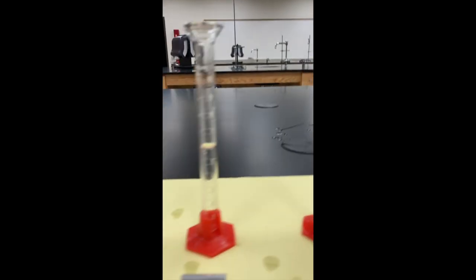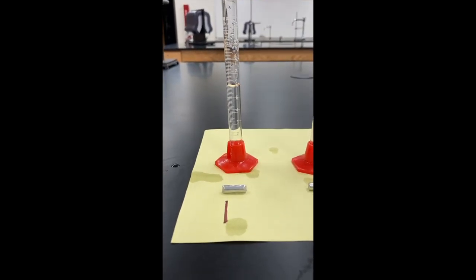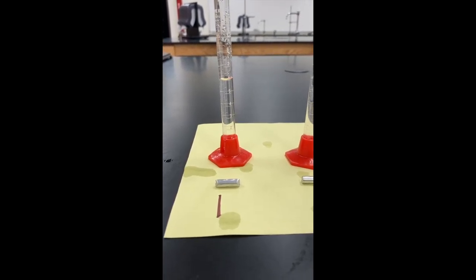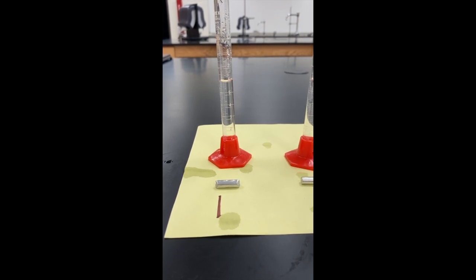So we're going to start off with six milliliters in our graduated cylinder, and what I want you to do is in your data table right now, write in 6.0 milliliters as your starting volume for each piece.